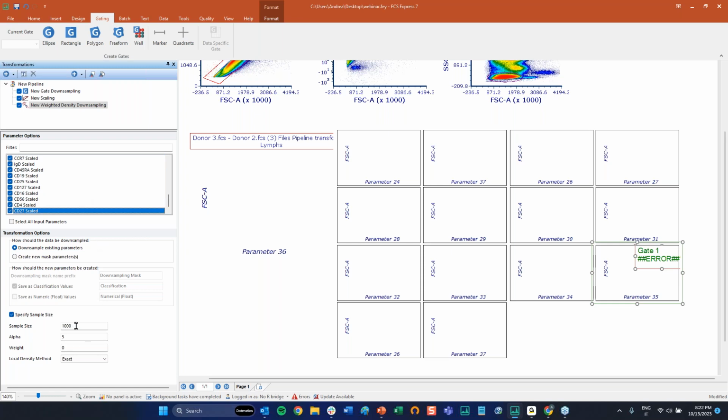Now, the weighted downsampling allows you to define a data size, like let's say 100,000. I should have like about 300,000 overall here. And the weight is the parameter that allows you to enrich abundant populations, which is usually what you don't care about, or enrich rare populations. Okay, if you want to increase rare populations, just set it to a negative value. Okay, this can go -10, +10. So 0 means basically do not enrich. Okay, do nothing, like just almost random sampling.